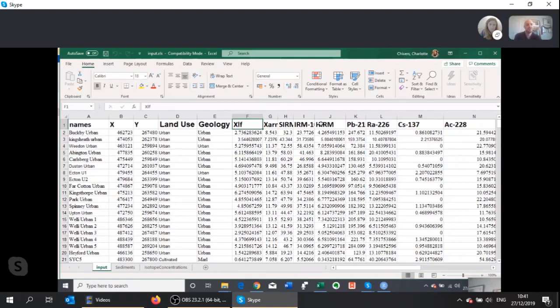So you have lots of zeros, like caesium-137 there. We're talking about some urban sources and channel banks, but we have some zeros in there, and it's fine if you've got a few. But if you find half the measurements are 0, or the same number, it's probably best to delete that tracer and just use measurements that you're confident in.